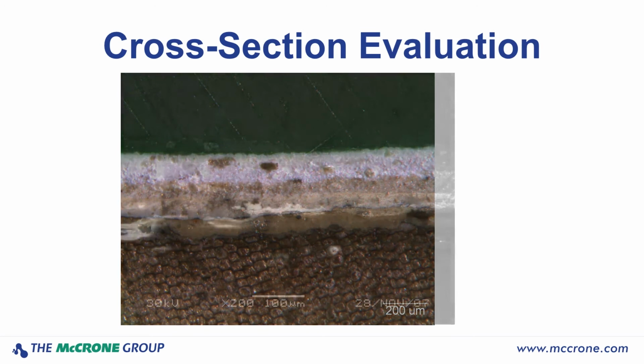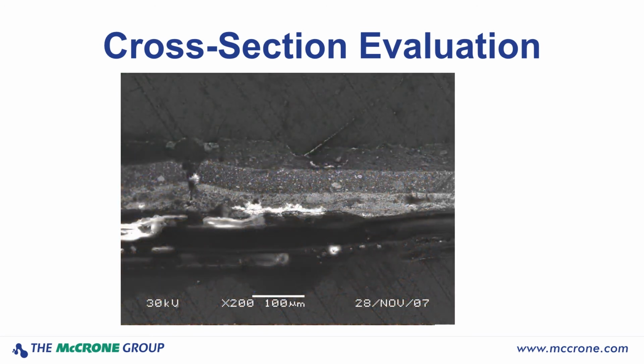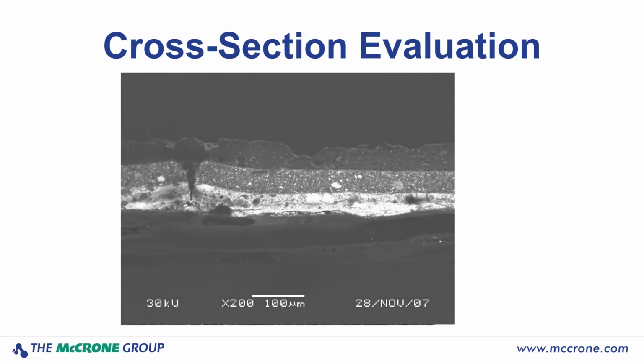We can look at it using SEM-EDS in secondary and in backscatter mode, which gives us more of an indication of which elements are present, and number these layers. Once this is determined, we can remove particles for other analyses, such as X-ray diffraction or others, such as FTIR.